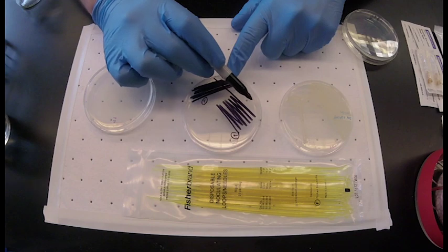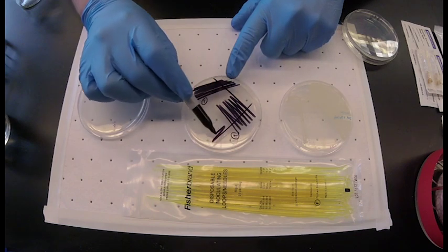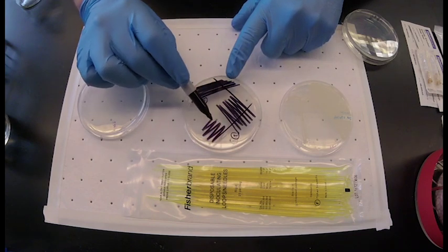Rotate the plate again and streak through the second area to dilute the bacteria into single colonies.